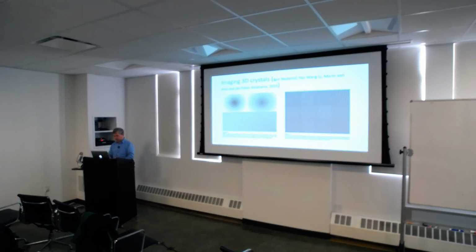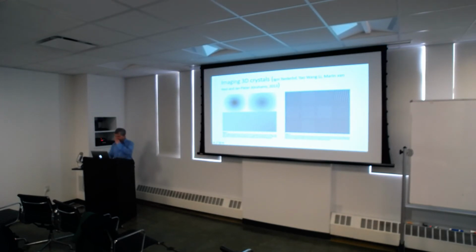There's a paper from 2013 where they were imaging 3D crystals and did standard 2D classification of them, and then saw these different projections. Maybe you could do something like that, image it, do classification, and work that out to get the phases, but that hasn't been done yet.